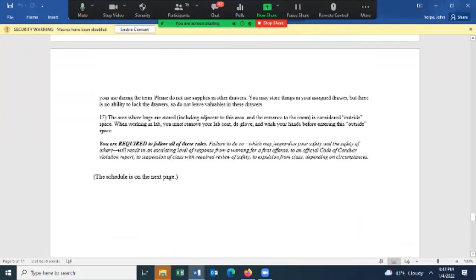When you're done with the culture, it should be put in the autoclave bag, and that's called a different name. What is that also called? The biohazard bag. And then it'll be autoclaved before it's put into the trash. Don't put your microorganisms in the trash can. For something like paper waste, like what you clean the bench top with, that, if it doesn't have microorganisms in it, can go in the trash can, okay? And that will not be autoclaved.